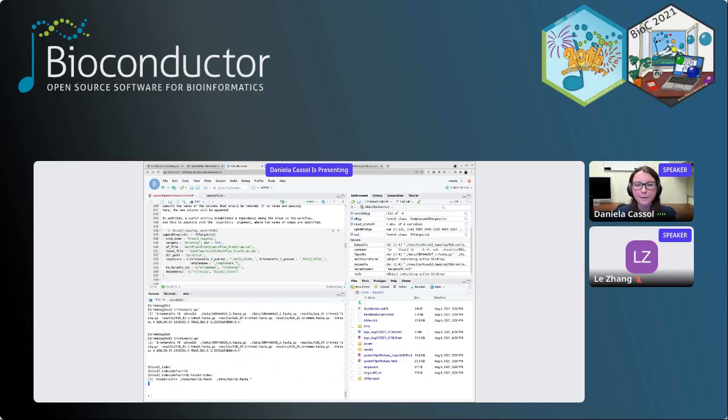And here I would like to add the mapping, right? However, for the mapping, I don't want to use the raw data. I want to use the output files from the trimming, right? So the files we create in the trimming. And then here, again, append the step, sysargs list, and then the step name. And then on the targets, in this case, we are accepting the name of the previous step you want to connect. So here we are building this connectivity between the steps, not just by the dependency, but by the inputs and outputs.